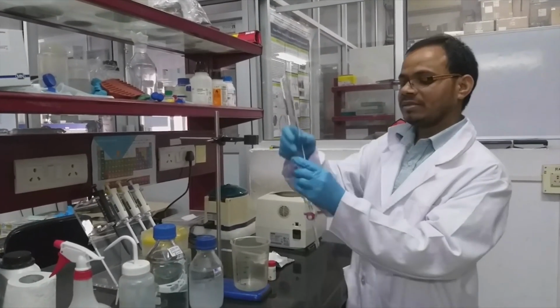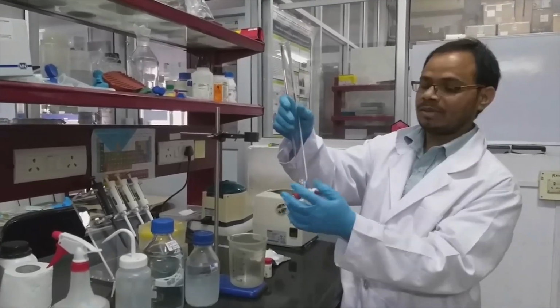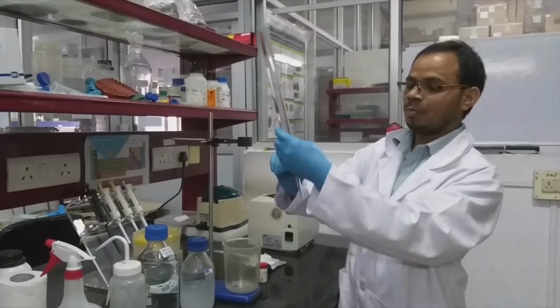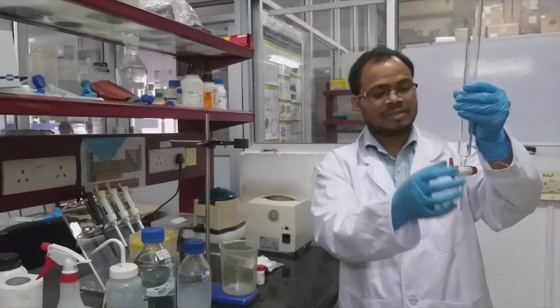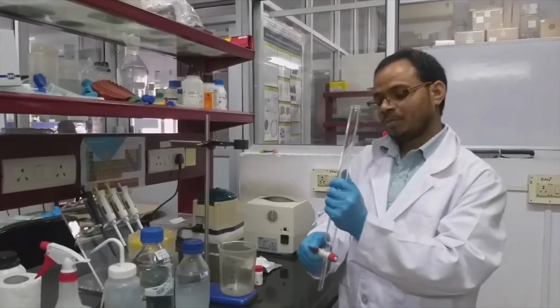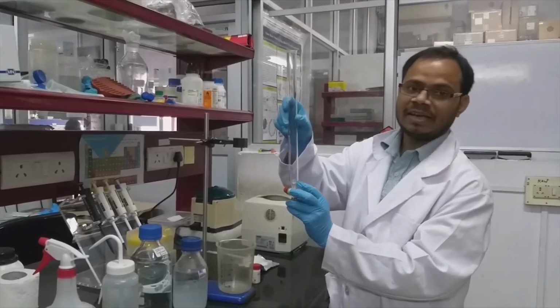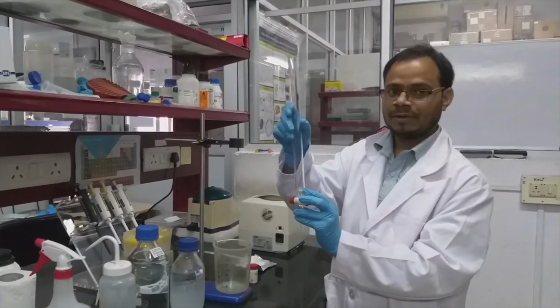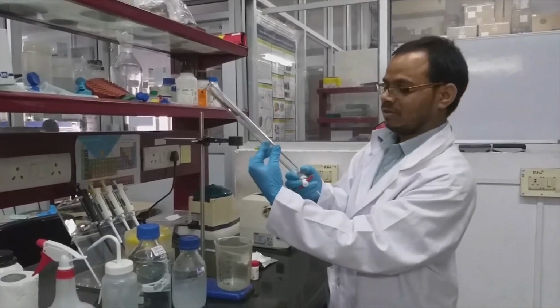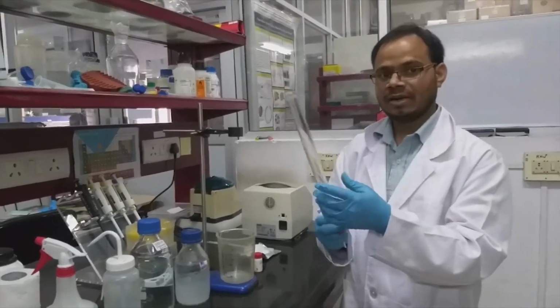Before using that, there is no support at the bottom of the column. So there is direct contact. If we open this, then whatever solution or beads are there will completely flow through. To prevent this, we have to block this area with a small piece of clean cotton. So I am going to first put some cotton in the bottom of this, then we will load the beads.